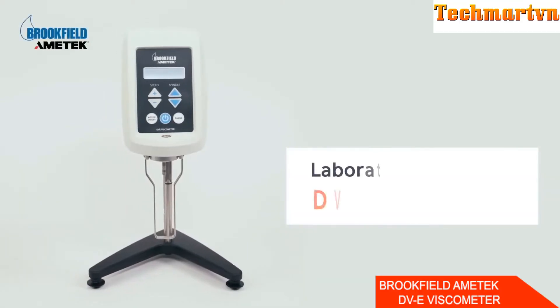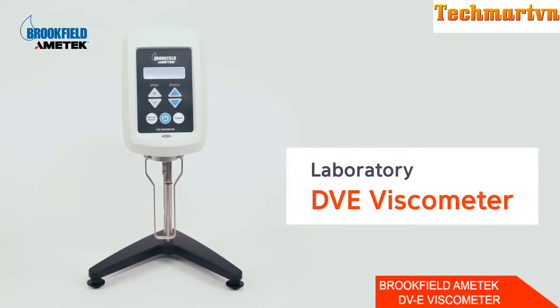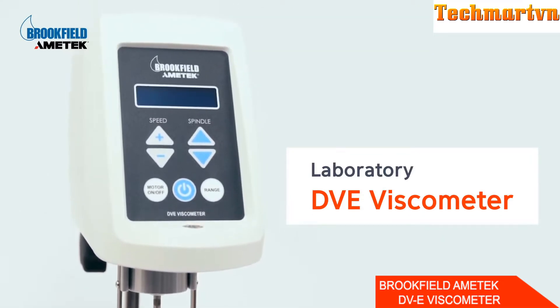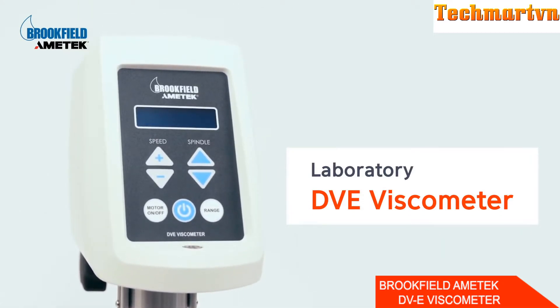The product we're going to talk about today is Brookfield's Rotary Viscometer DVE model. This model is suitable for routine viscosity measurements. There are 18 speed choices available, and it uses an LCD display to show information.